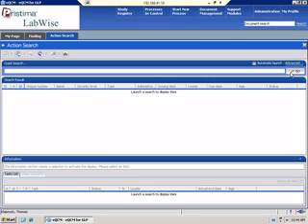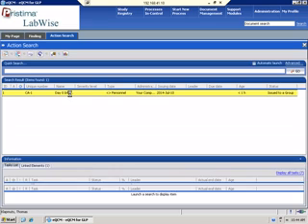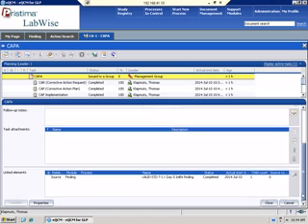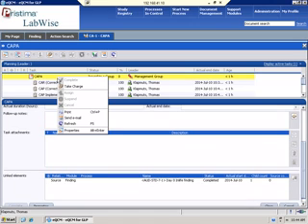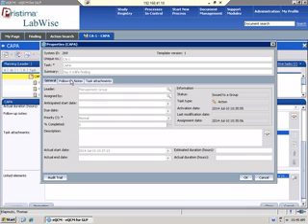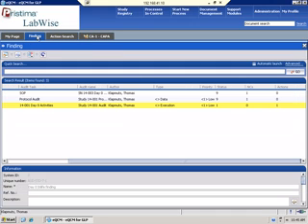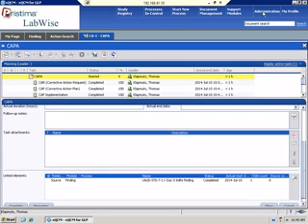We can go in and look at the CAPAs just like we did for findings. And again, the system lists out your CAPAs. You can search them by the audit name, the number, personnel. You can open it up and see the process and the form. So I can take charge of this to close it out as the supervisor. I can also look at the properties, if there's any follow-up notes and task attachments. So there's our findings, our CAPAs.